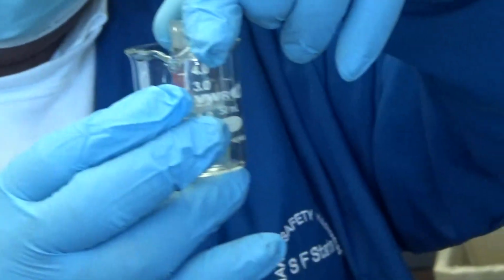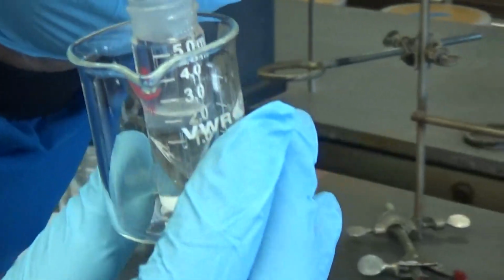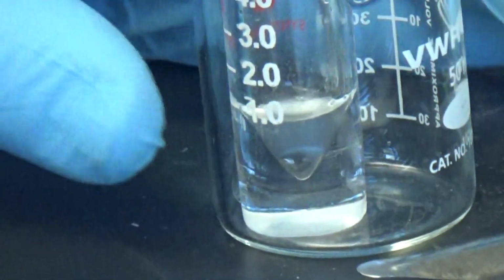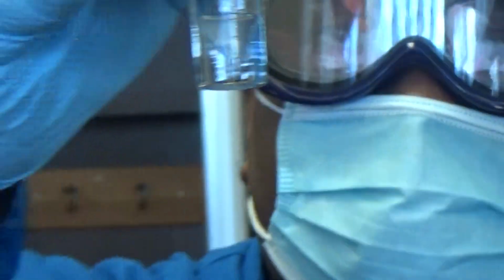So I put that back here, and the same process. As you were saying, you put the pipette, it goes to the bottom, and then you suck out. There we see it. You get to the interface. The second one has a little bit more at the bottom, but that's not a problem because we don't have enough product. The drying agent will take care of that.